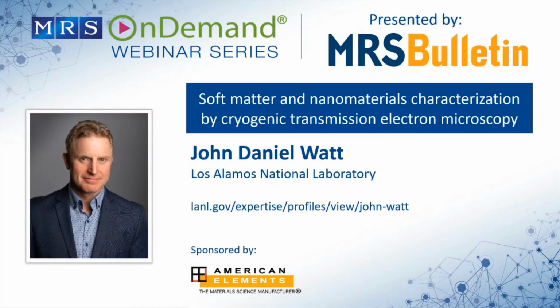But what I can say is that, with the use of these direct electron detection cameras like the K3 and the K2, we are pushing the dose rates for those cameras to their limits, to what they can do. And I think, probably in the biological space, they're doing that as well. Yeah.